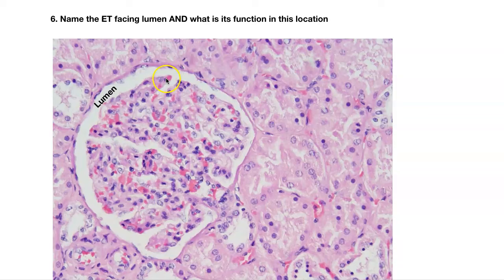Number six. You've seen a similar slide. Name this epithelial tissue facing the lumen — this is so beautiful. This is simple squamous. This is the kidney — specifically a glomerulus. We are taking blood and filtering it to start making urine. So the function of this simple squamous is filtration.